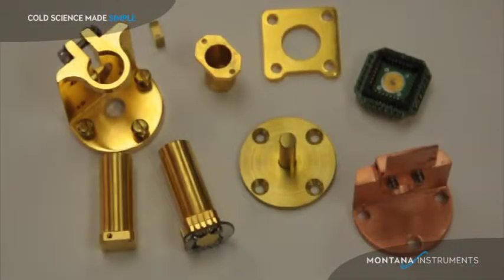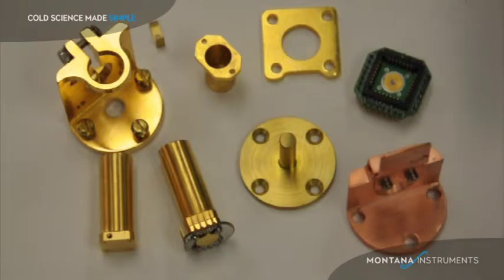You can create any number of interface plates to mount to the grip bracket of the platform itself. Here are a number of examples that were created for various experiments. You can make them from copper, but you really should coat them with gold or nickel bright finish to keep the emissivity low.